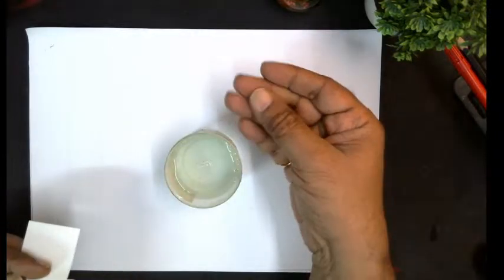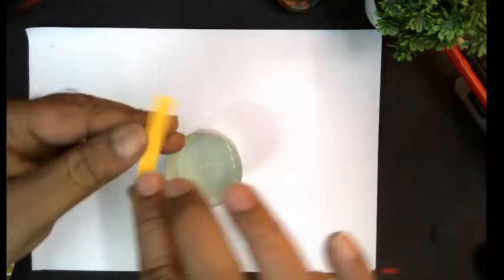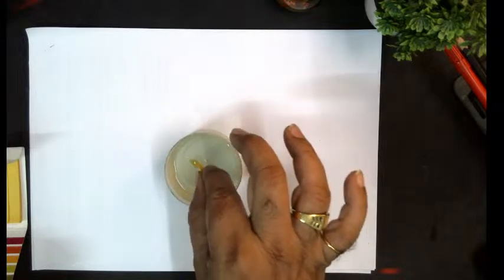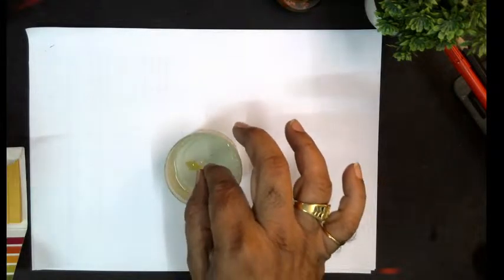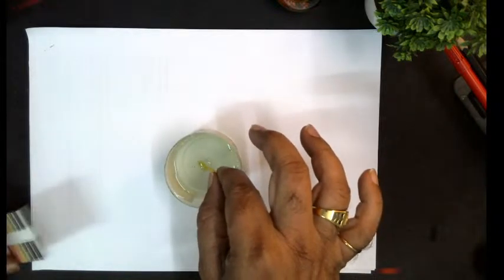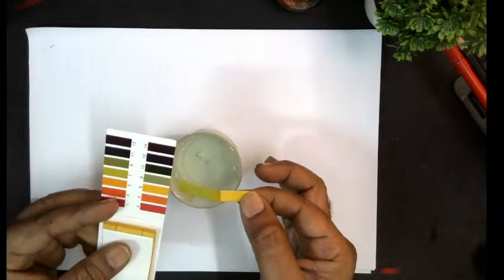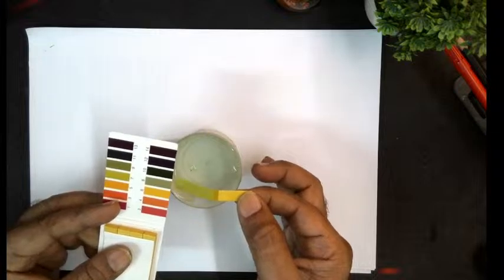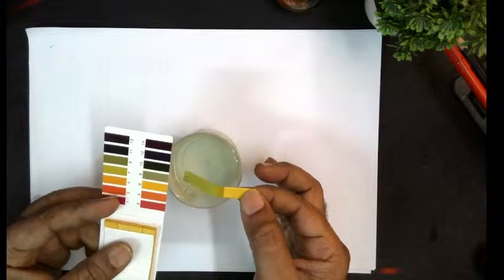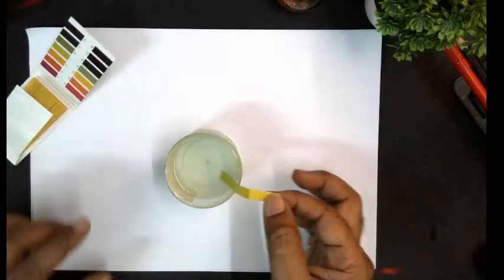Now the hand should be free from any water or any solution. Take a strip of pH paper, and dip it gently. Okay, now you can check the pH is 8. Are you able to follow? Because I have not added any strong alkali, I have taken only a weak alkali, that is why it is 8. I hope now you can find the difference here.